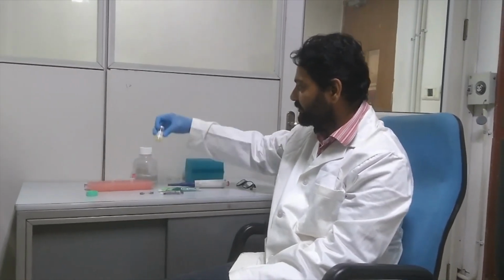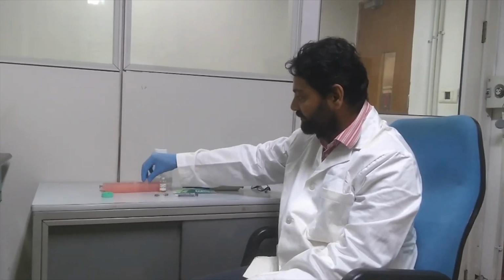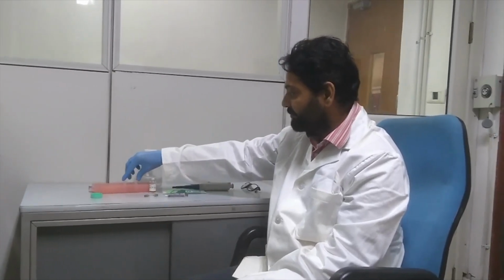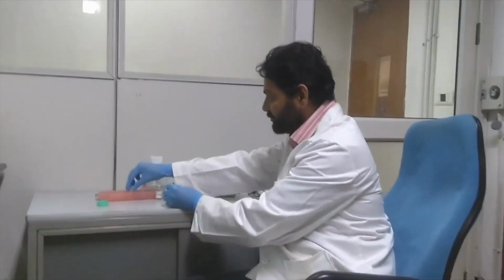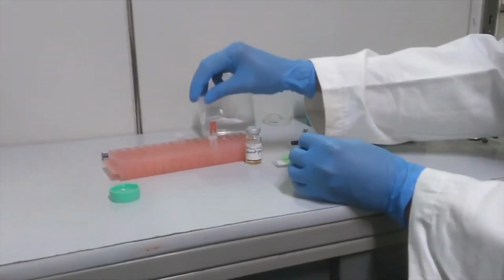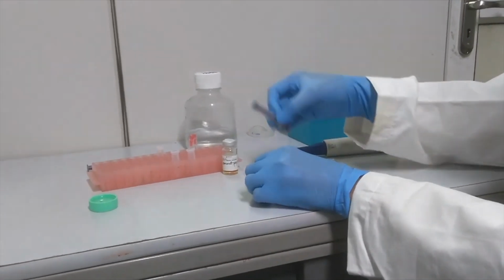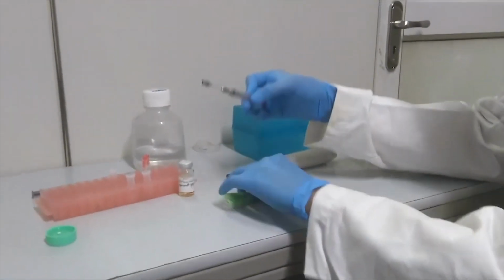Then we take out some of the Freund's complete adjuvant in an Eppendorf tube and mix them together. Since this adjuvant is oil based, it doesn't mix easily with a watery system like the antigen in PBS. Therefore we mix them vigorously and forcefully. For that purpose, we take these two and mix this emulsion, the PBS containing antigen and the oil-based adjuvant. After mixing them, we take it out in a needle. Using a needle, we take it out in a syringe like this, and then we fix the microemulsifying needle into it. Attach another syringe to it.